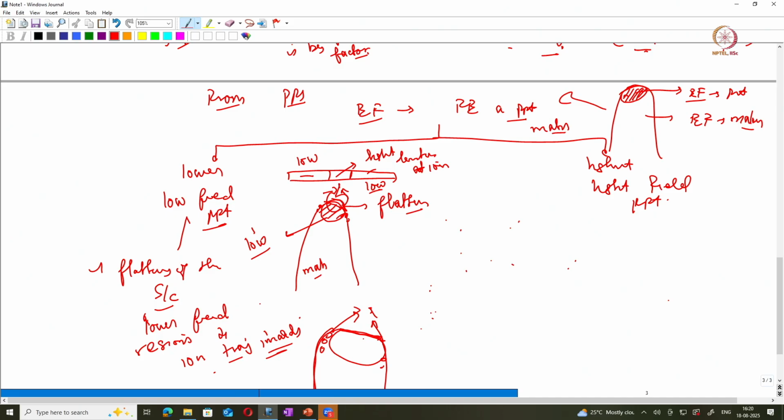Okay. In the case of high field precipitates, you have a needle specimen and a precipitate which has a high field, meaning the evaporation field required for the precipitate is more than the matrix. Then if there is a detector here, this particular precipitate gets bulged out.